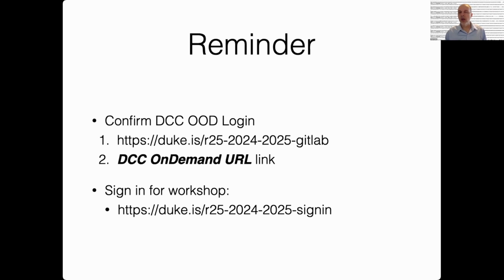And so almost always for RNA-seq data, it's going to be much more useful. When I say much more useful, I mean it's almost useless without the annotation. I can think of examples where you wouldn't need the annotation, but almost always you want it. So hopefully that answers the question. Like I said, I'm pretty sure you can run STAR without an annotation file, but for differential expression, it's going to be essentially useless.